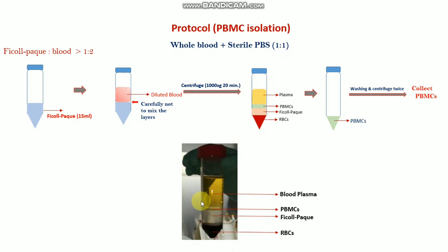The total volume in the tube should not exceed 45 ml. Here you can see: the first layer is the blood plasma, then the PBMC layer, then the Ficoll-Paque which is very transparent, and the lower layer is the RBCs.